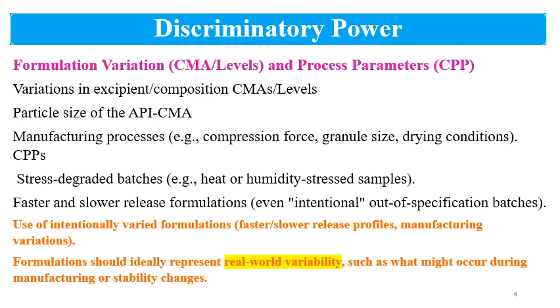You can play with the coating weight gain in case of pellets. So many things are there. Whatever you understand is critical, change that in a meaningful way, and it should represent the real world variability, and then perform dissolution testing and see whether it is reflecting in the dissolution or not.